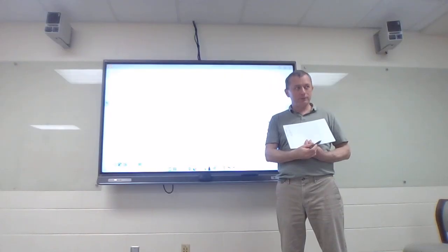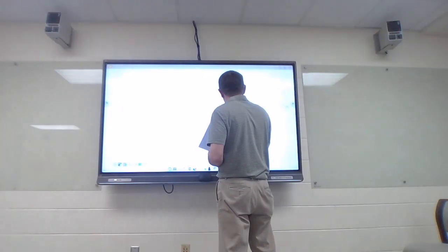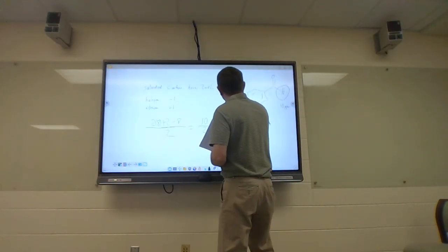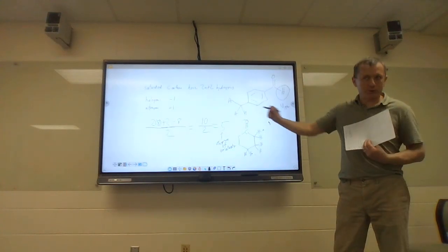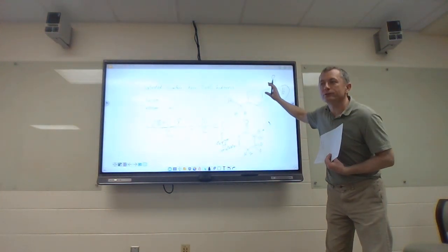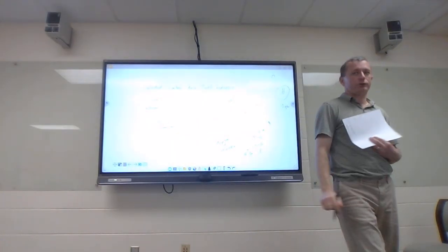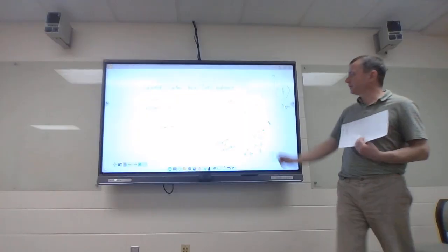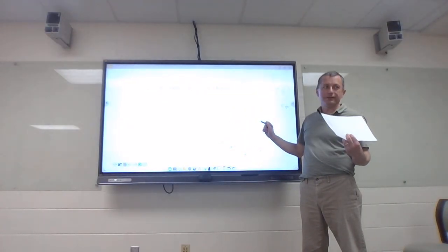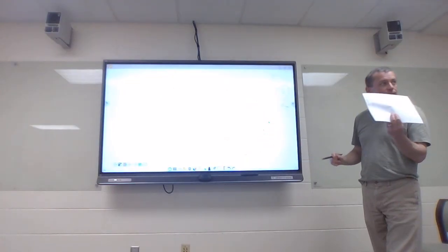It's up around 2, which is where we see hydrogens on a carbon next to the benzene ring. Hydrogens on carbons next to ketones, aldehydes, next to the carbonyl, or next to the benzene ring will show up around 2-ish. Here, it integrates to 3, and it's a singlet. There's no hydrogen next to it, so that fits.